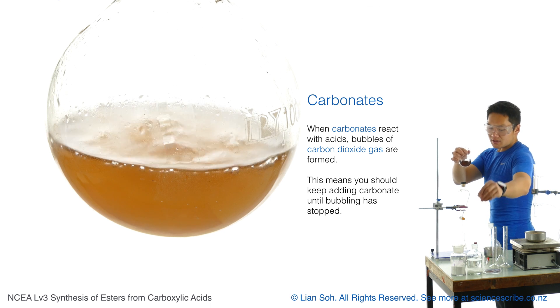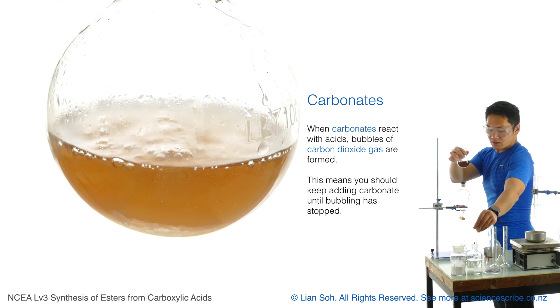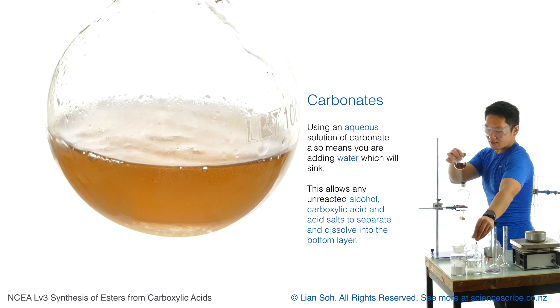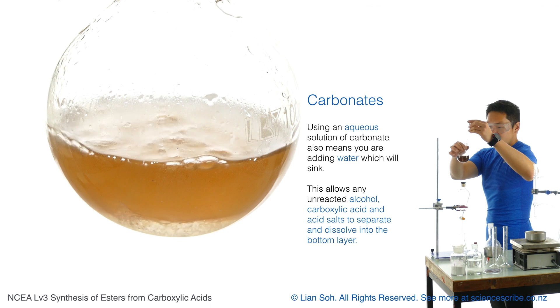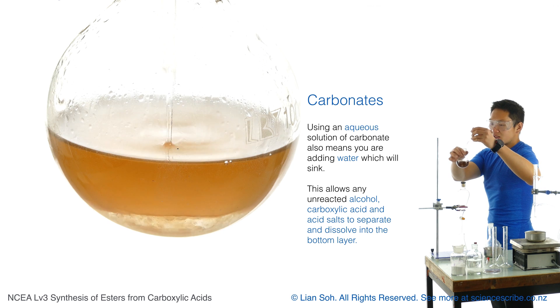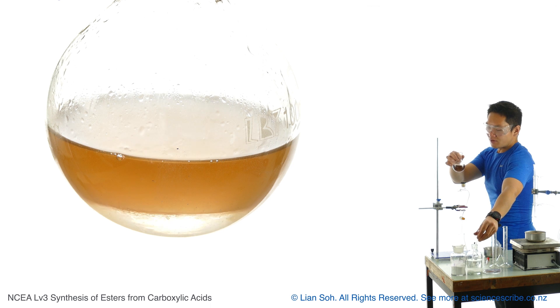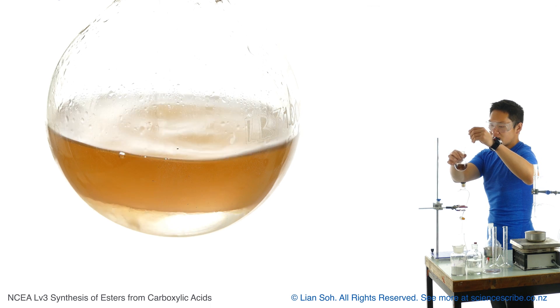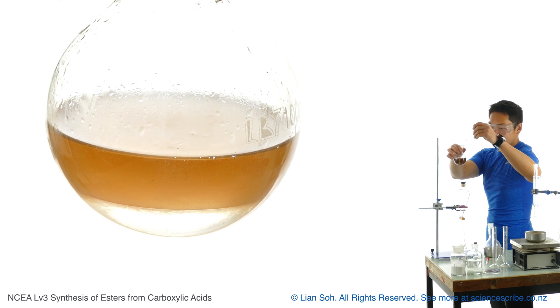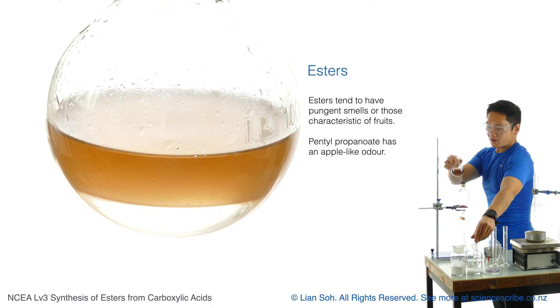I need to keep adding carbonate into my flask until I stop seeing bubbles appear. This helps neutralize it. As I'm adding more carbonate, it's bubbling from the bottom. Esters are non-polar, which means they don't actually mix with water, and the sodium carbonate solution I'm adding is mainly water. So I expect my sodium carbonate solution to sink to the bottom as it reacts, while my ester just floats on top — you should see two layers forming in this flask.